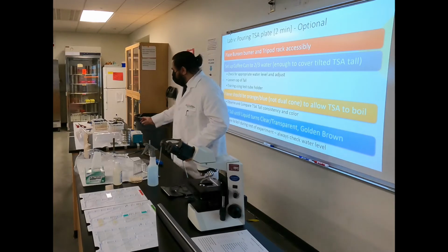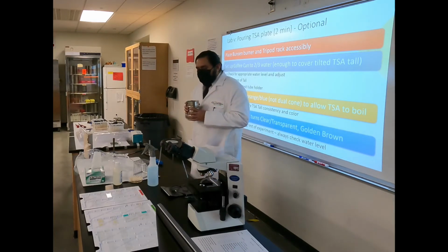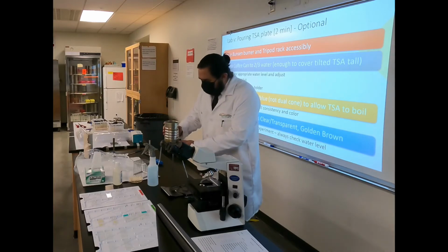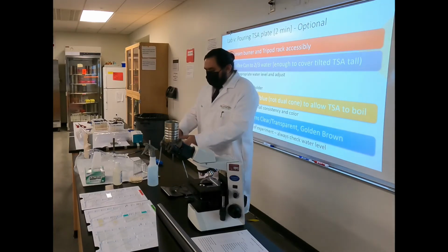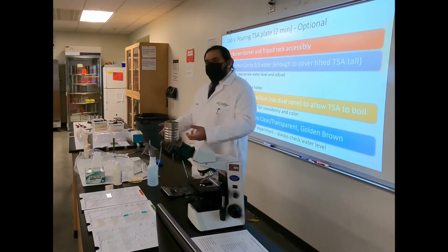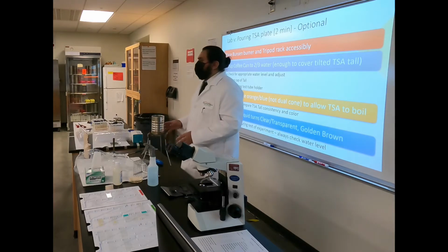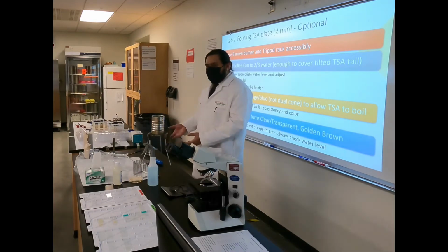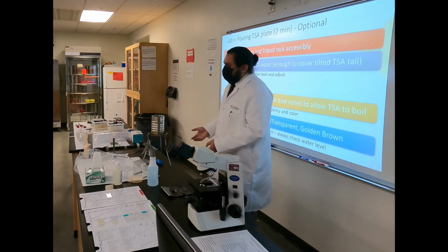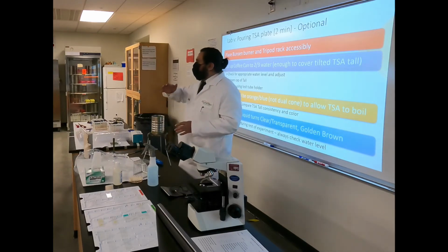So what we're going to do is, mine already has water. These are supposed to be empty. You're actually going to place your coffee can, that's the big one, the soup can is usually the small one, right? And if you need to adjust it, again, don't drag, lift it to wherever you need it to be. Now, obviously, if this is already on, don't touch it. Let it cool down before you move it, right? I know I need to say these things sometimes. I don't want to be sued like McDonald's kind of thing, right? So you're going to fill it up with about 2/3 water.